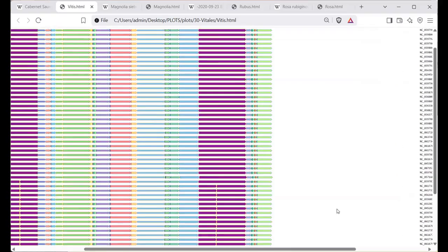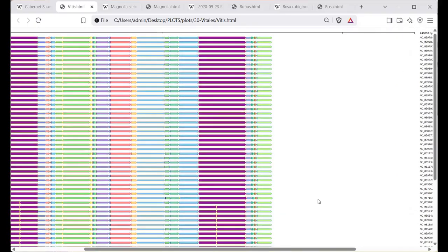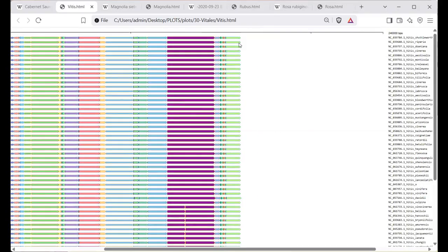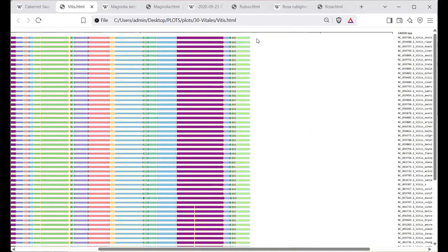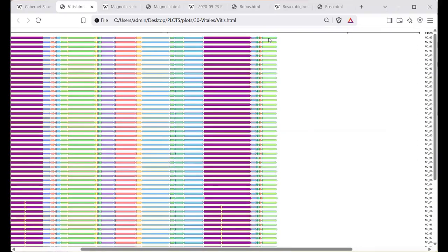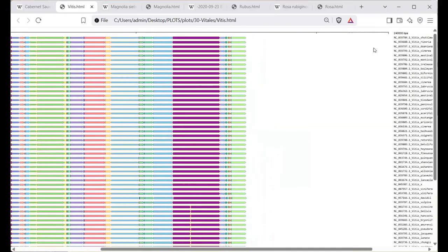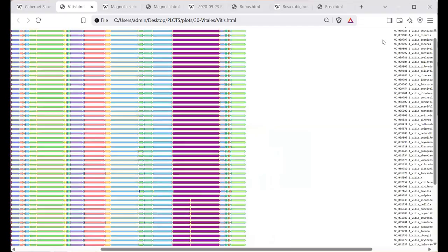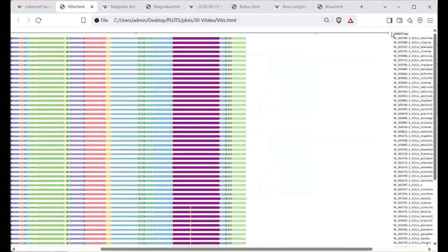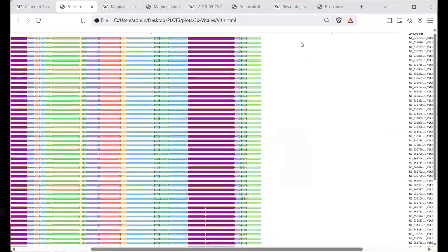But usually you see that most of these other sequences are of the same length, and that length is usually around 150 to 160,000. That's a typical length of a plastid. Sometimes it can go to 110, 120, but it stays very close within our range. This one particular sequence that got too large gives you this range of 240,000. So on this top, you can see the scale.